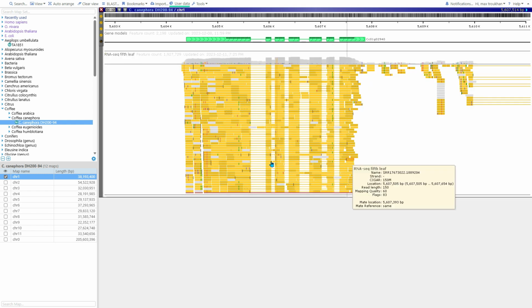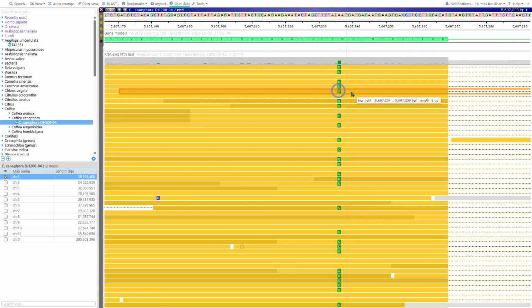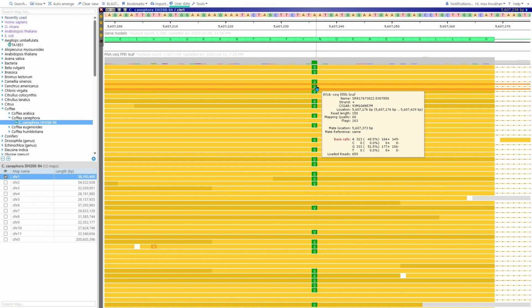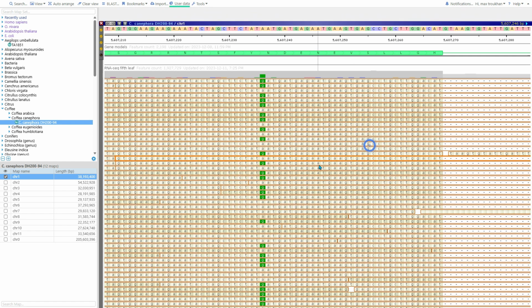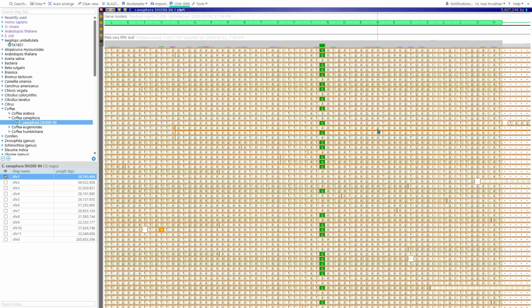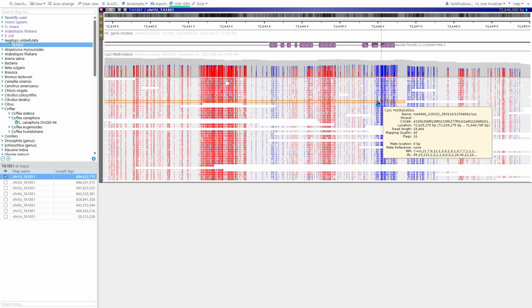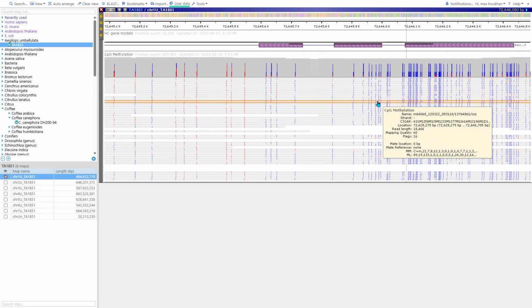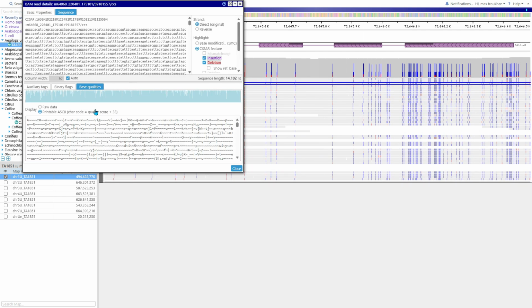The RNA-seq data is a valuable resource for assessing the quality of gene prediction, measuring gene expression levels, or finding sequence differences. There are multiple display options for the alignment tracks. Some are turned on automatically, depending on the nature of the aligned reads. For example, if the reads contain methylation signals, the color schema changes to reflect the methylation scores. A click on the read opens a form that shows the read properties, such as base qualities or the read sequence itself.